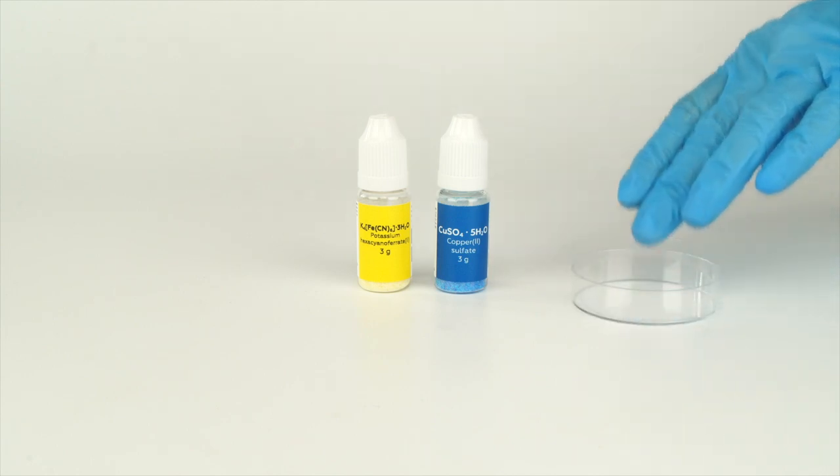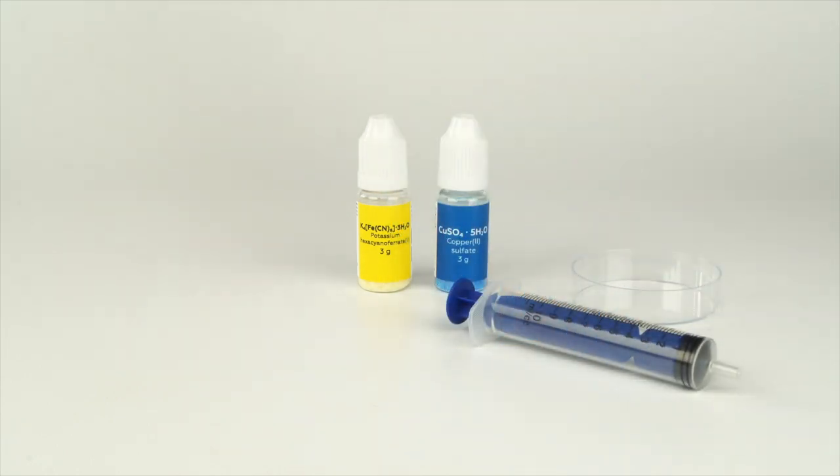Take the small petri dish, a syringe, a piece of filter paper, and two cotton swabs from the experiment set, and fill a disposable plastic cup with water.